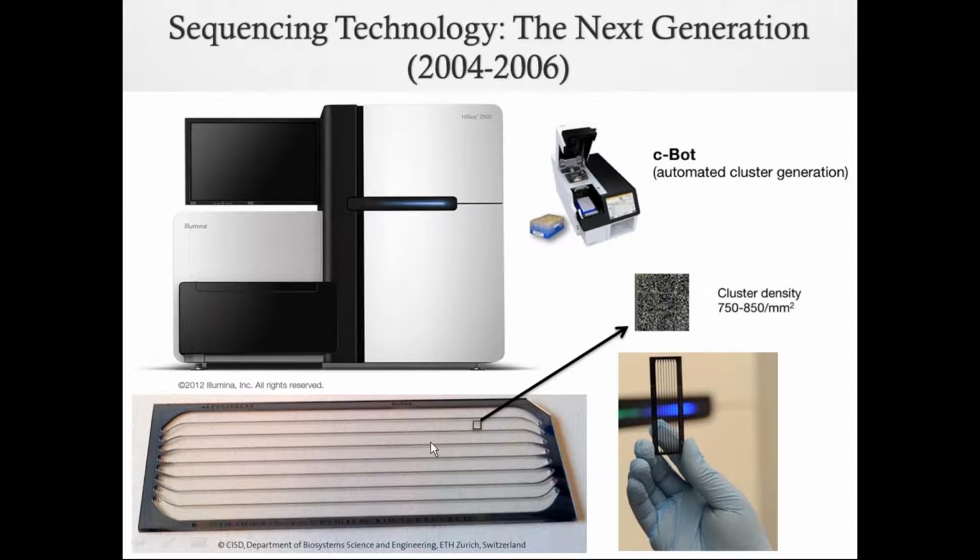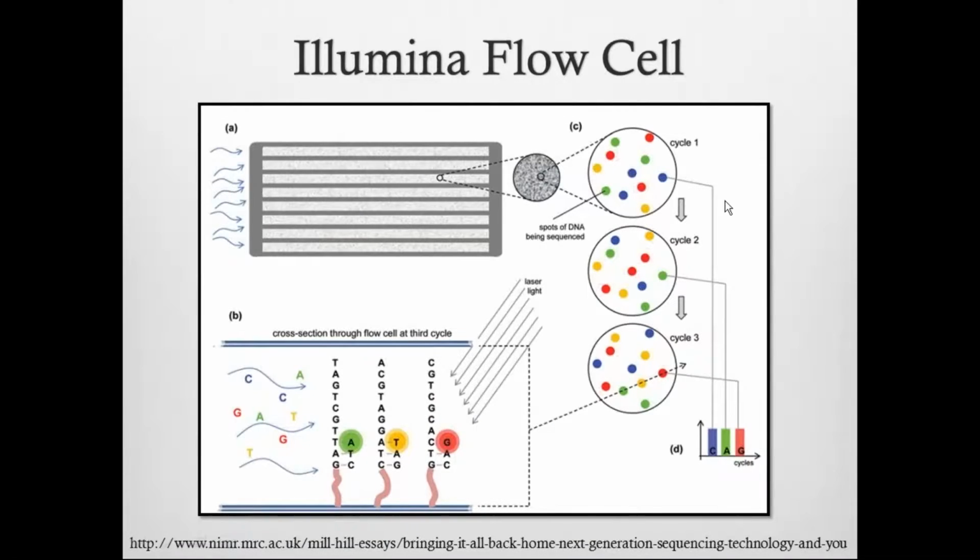Then they automated it by using fluorescently labeled nucleotides, and then a laser could automatically read the bases. So you didn't have to read them by hand yourself, and you still had the same slab gel and the limitations on the number of lanes. It was improved again using these capillaries. So now you can use up to 96 capillaries for some of these big sequencers. That's how the human genome was originally sequenced.